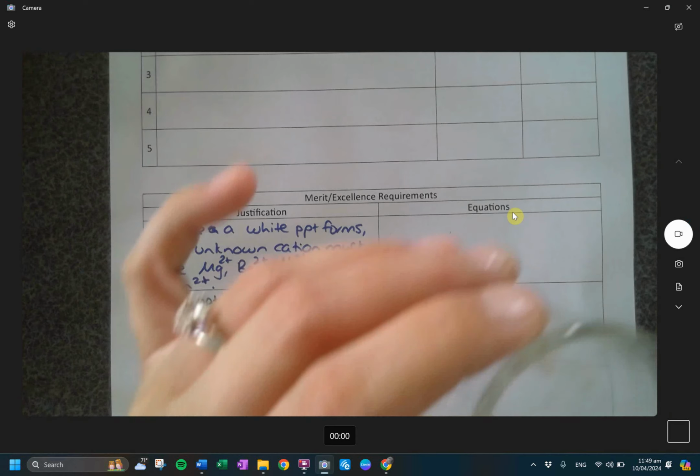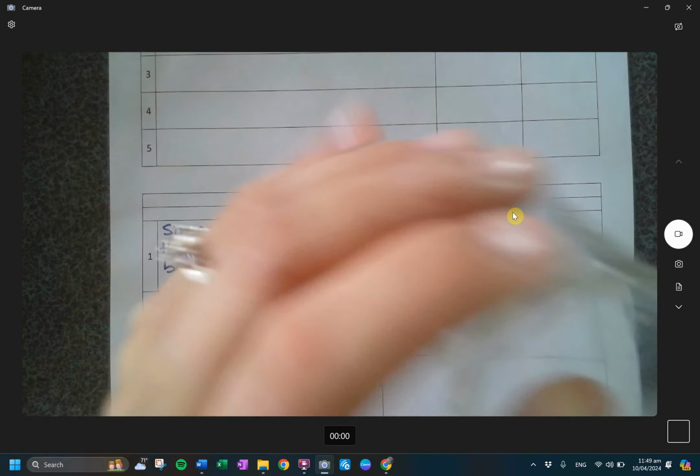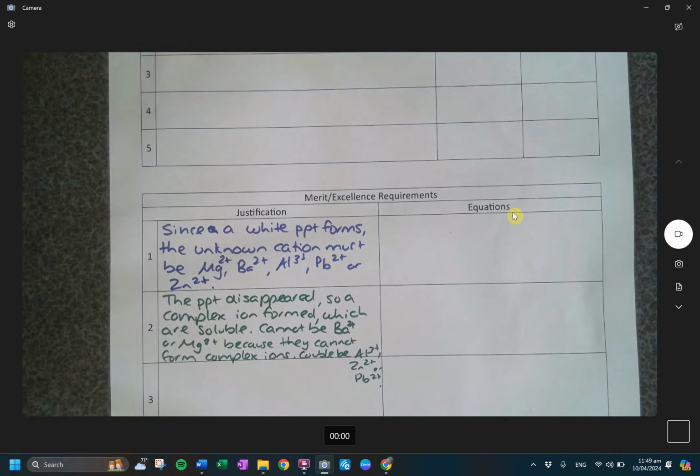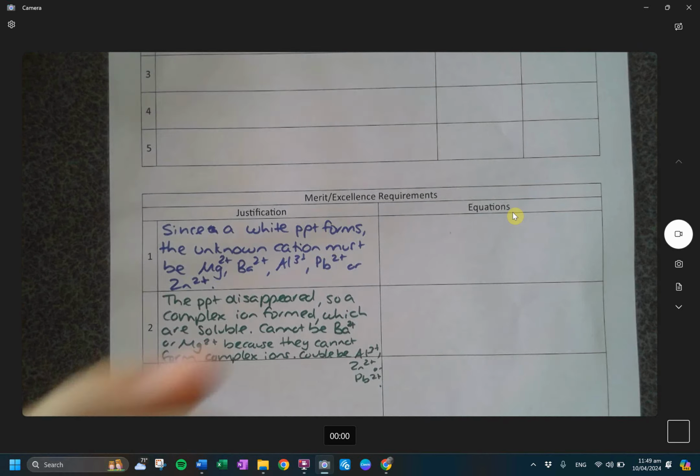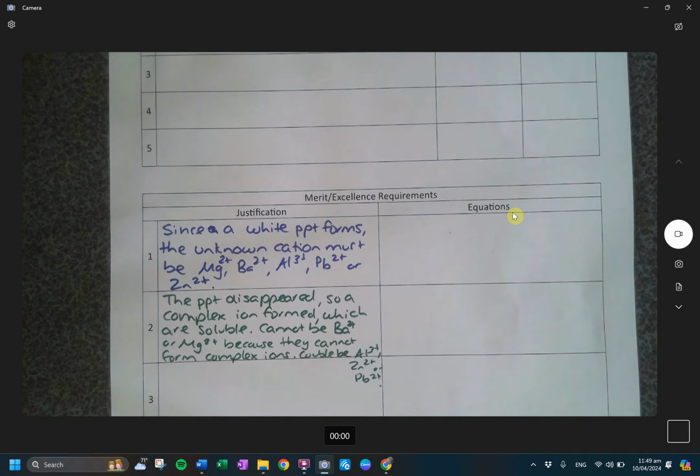So back to this guy here. Back to adding a little squirt of that. All right, and then find our ammonia, which is normally in the bigger bottle. We add 2 drops. Now this might be a ratio game that you have to play. You might need to add a little bit more ammonia and a little bit more of the unknown until you get your precipitate forming because you have to get the right ratio. So don't be surprised if you need to play with this a bit. You might also need some stronger ammonia, which this might not actually be good ammonia.